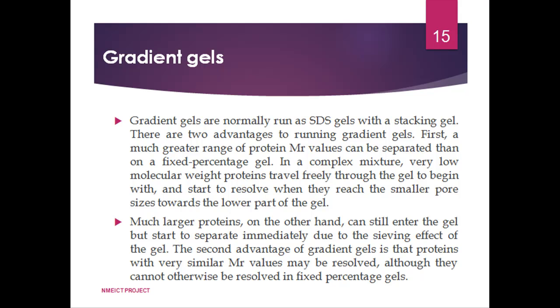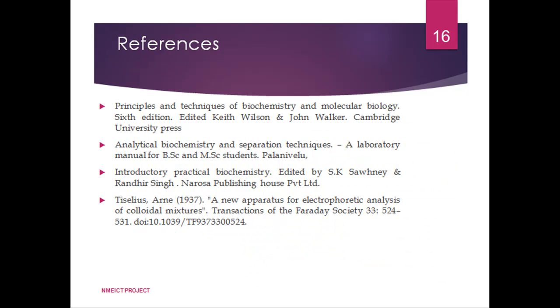The second advantage of a gradient gel is that proteins with very similar molecular weight can be resolved, although they cannot be resolved in a fixed percentage gel. As each protein moves through the gel, the pore size becomes smaller until the protein reaches its pore size limit.